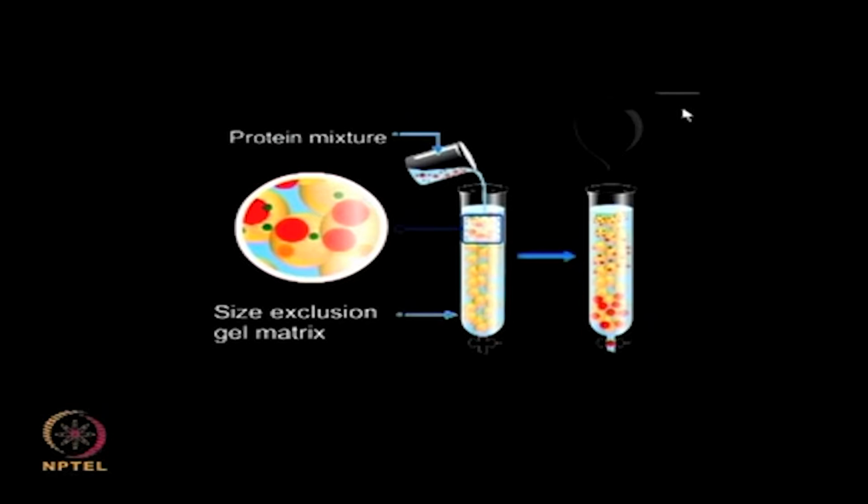agarose or polyacrylamide. The protein mixture is a mixture of unpurified proteins of different sizes, which is applied on top of the column. Mobile phase. The proteins are eluted out of the column by using a suitable mobile phase that carries the protein out for elution. For gel filtration, a salt solution of appropriate strength is commonly used, so that it will not have any effect on properties of the proteins being purified.